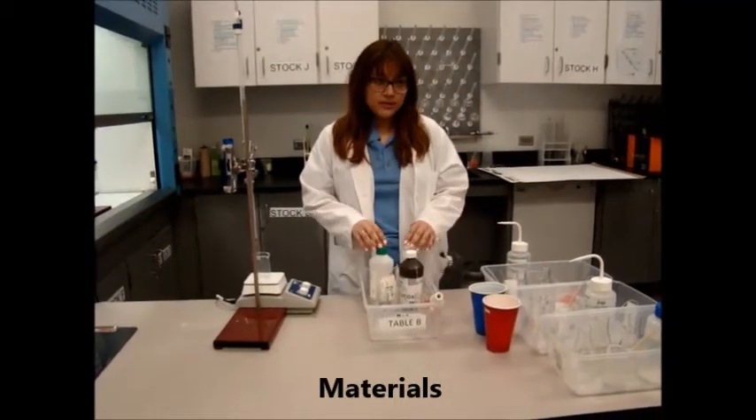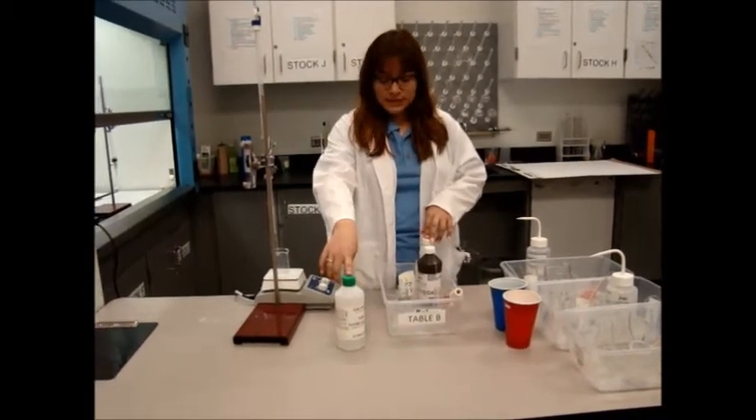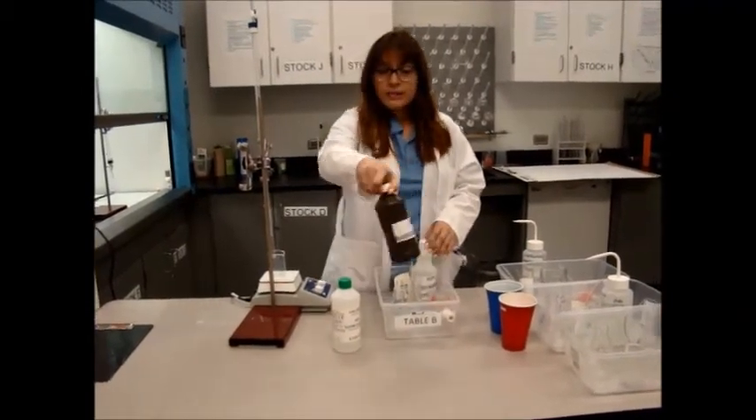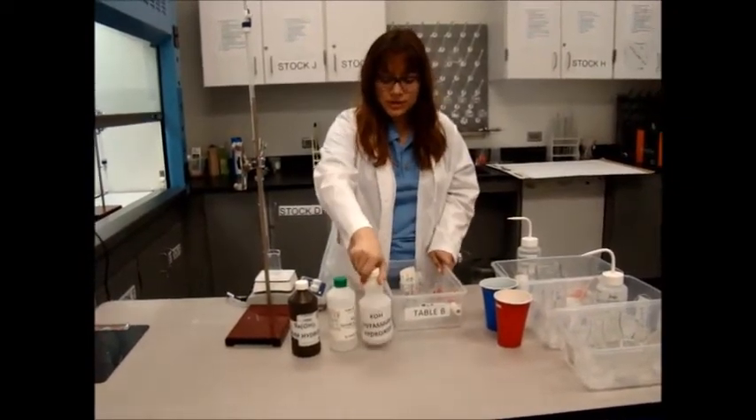First we're going to start with the solutions. The first solution is 0.25 molar sulfuric acid. This is barium hydroxide. And the last solution is potassium hydroxide.